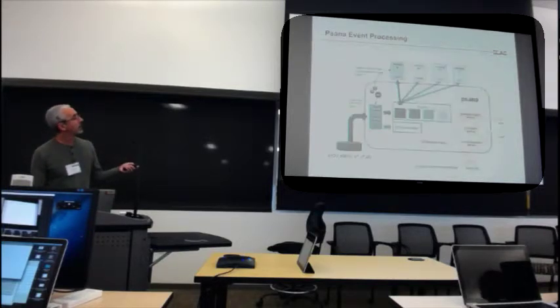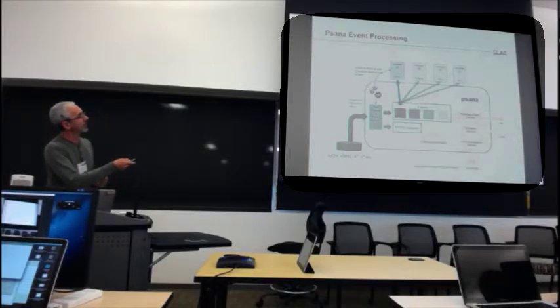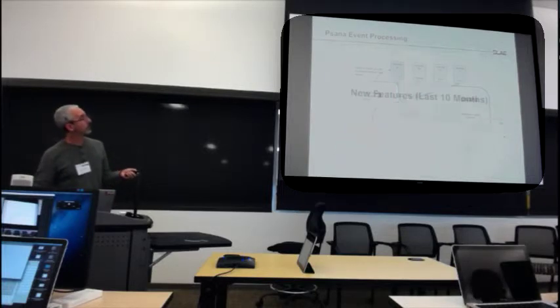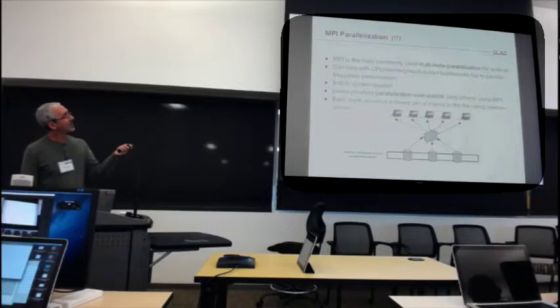All right. So there's just a few other things about Psana. I'm going to skip over this slide. This shows that you get these events from the XTC file, and then you just can put them through these different modules. And Nick uses these modules to do various stages of the crystallography stuff. So here's the new features. This is the main thing I think I wanted to communicate. I'm telling you guys, the users, but also the developers.